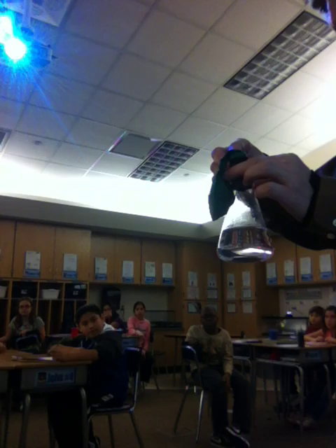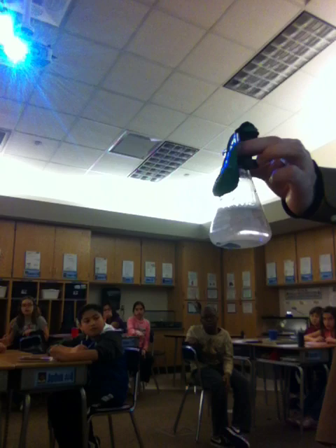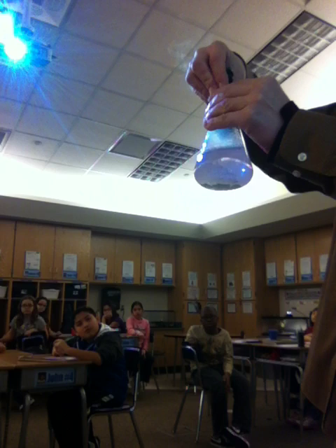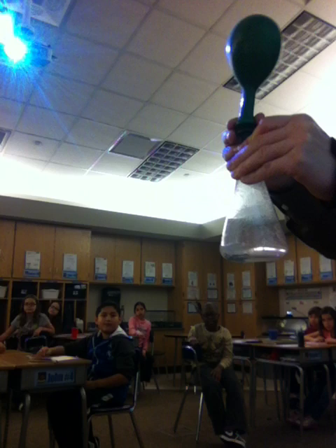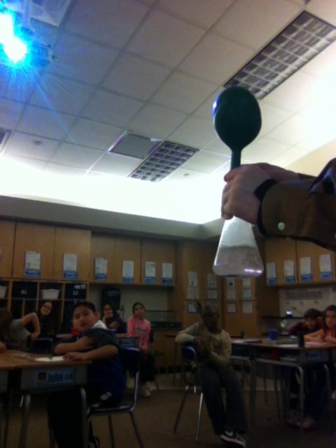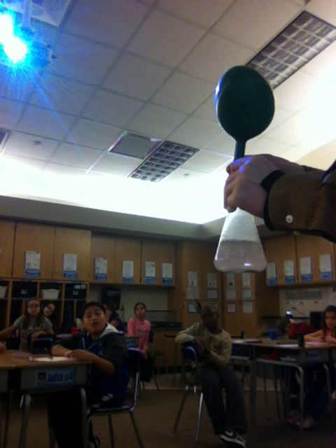I'm going to start dropping my pieces of zinc in here. You're going to see that it's going to start to bubble, and that white gas that comes out is hydrogen. I want it to inflate the balloon. Now, if we get enough hydrogen gas into this balloon, do you think the balloon will float?